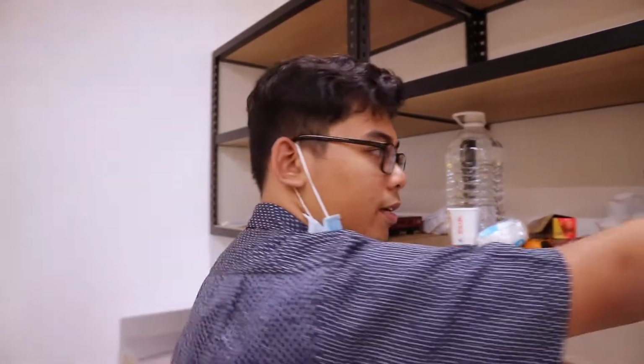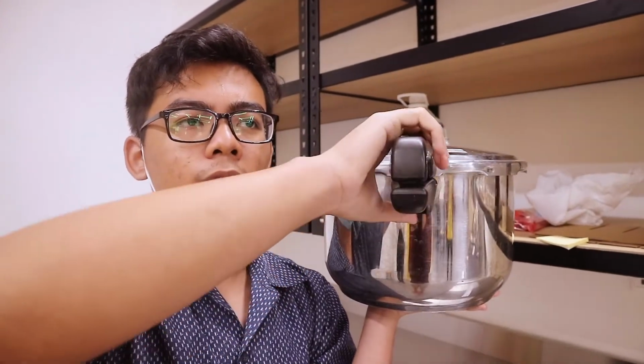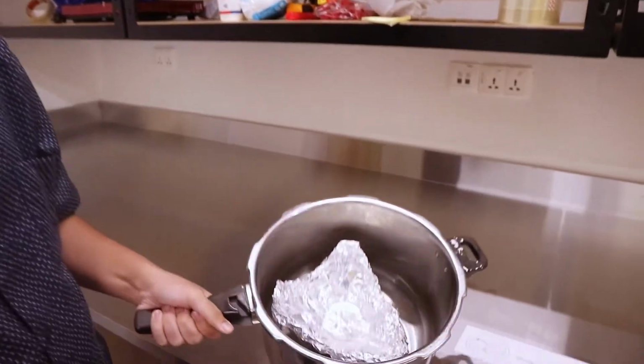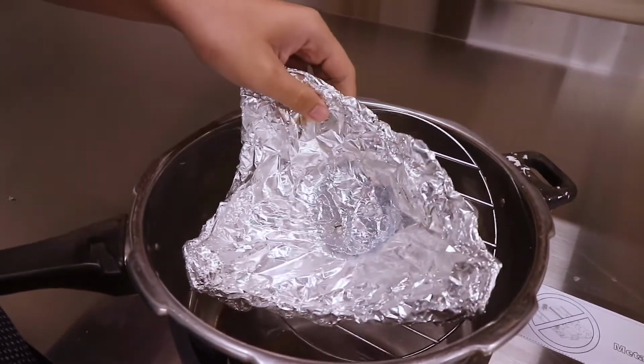In the meantime, we will want to prepare the pressure cooker because we don't have an autoclave in this lab. We use a pressure cooker to sterilize our agar solution. You can see this is taken from the kitchen. We have a stove out there. We will use it to do the sterilization. And what you want to do is you put a little bit of water inside of this. We have prepared a platform so that the beaker would not touch the water surface.